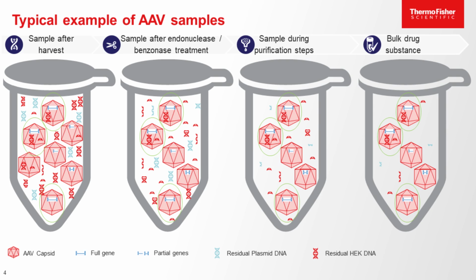We've lost a few capsids, but what's in the capsids is still in the capsids, and that's obviously not surprising, as the purification process cannot remove residual DNA that is encapsulated.